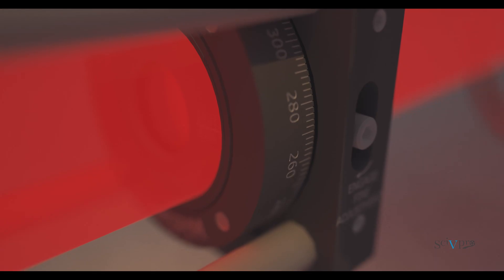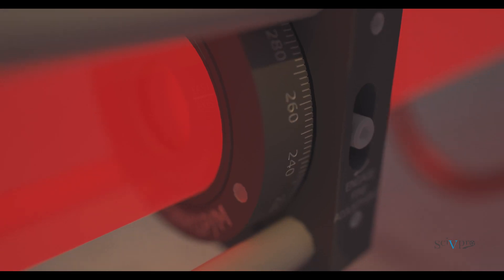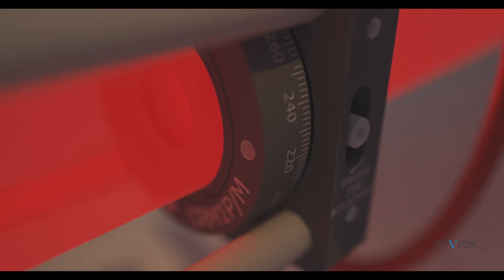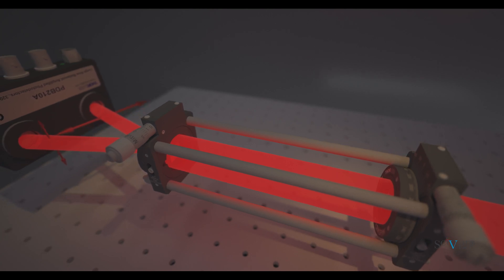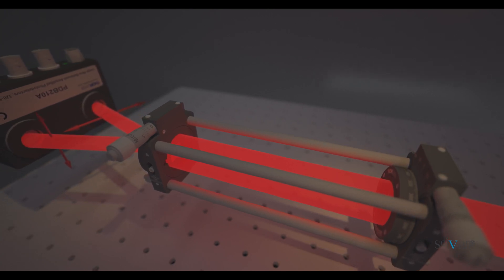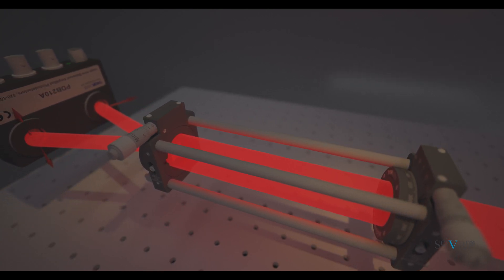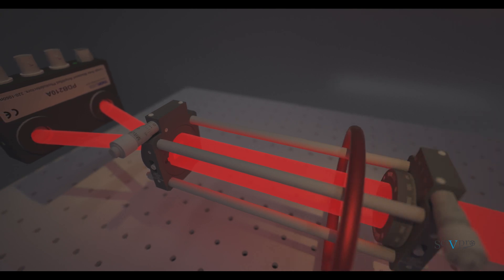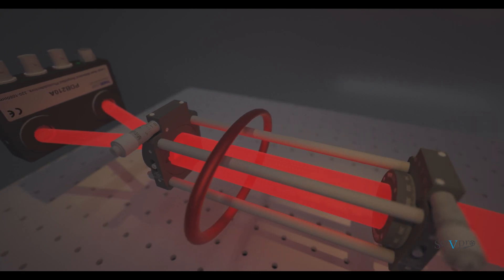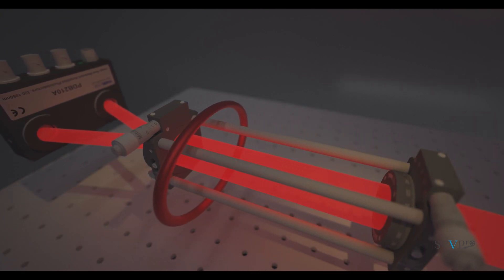The compensation procedure consists in adjusting the quarter-wave plate until the reading of the balanced photodiode is close to zero volts, or equivalently, until the probe pulse exiting the quarter-wave plate is circularly polarized.